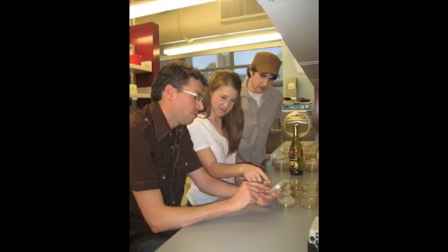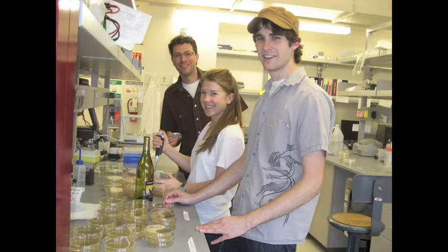The literature is rich on different uses of SO2, but not particularly rich in this area — this multidimensional problem of when wine is barrel fermented and sweet, what's the appropriate amount of SO2. Trained as an organic chemist, I've learned a little cell biology and now I'm learning microbiology in collaboration with another faculty member here at Seattle U and with Erica at her winemaking consulting company. Ultimately, the test is the client and the consumer — if the wines taste good, then we will have done well.